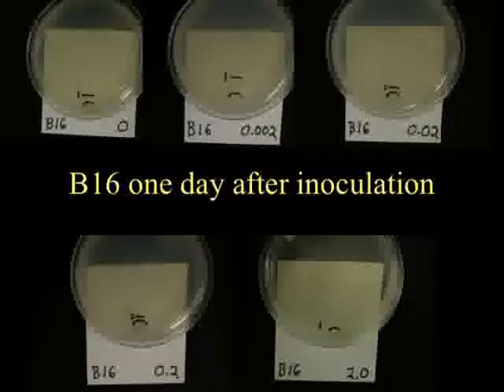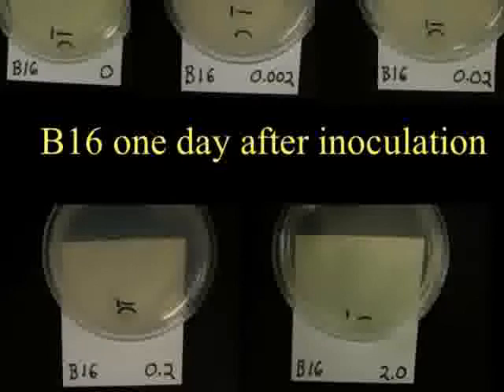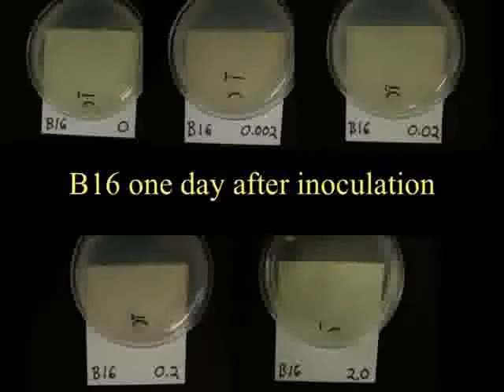Now, if you look at B16 photographs for day 1, it looks like B16 grew more on the 0.002 micrograms per mil plate than on the plate with no fungicide. And in fact, that's exactly what happened. That's a phenomenon called hormesis. And in hormesis, a small amount of a toxic material can actually stimulate the growth of a particular organism.